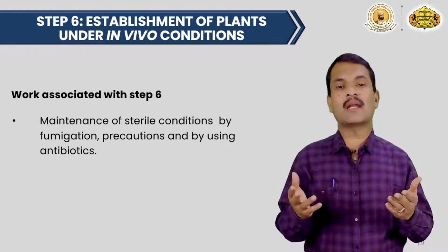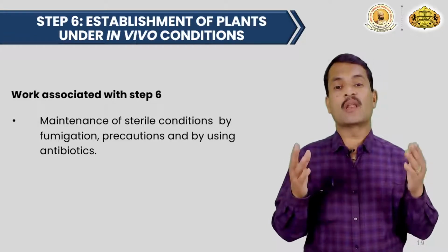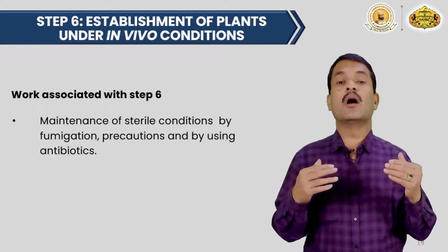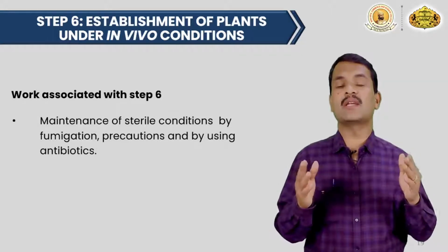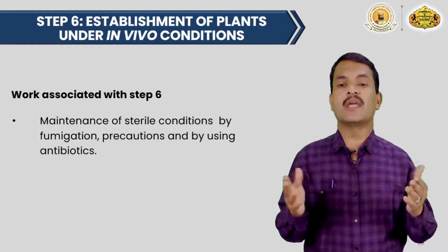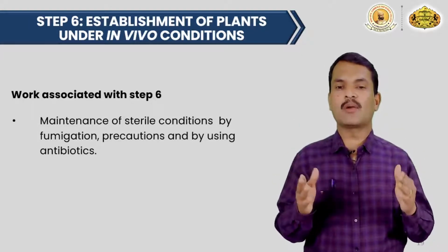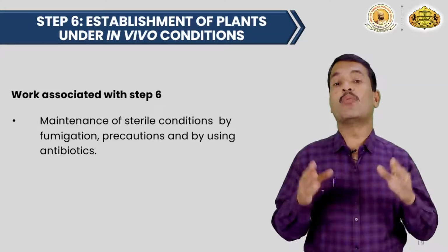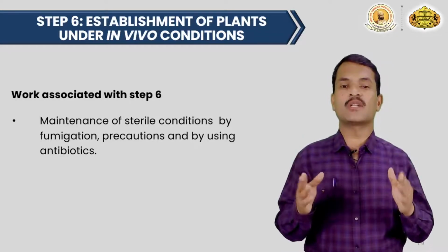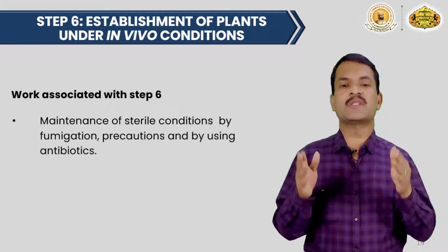You should use certain kinds of antibiotics or certain chemicals to control it, right? Entry here also is restricted. Too many people visiting this area is also not good, so you need to take care about that. Regular workers know what precautions they should take, so they are going to follow them. Because of that, only such people are allowed.